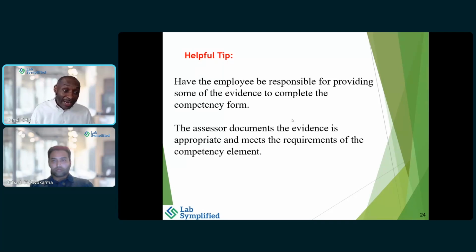You'd be surprised at things that you may see that someone does, and you ask them, well, why did you do that? Well, such and such told me that, or I learned this. Nope. If it's not following the SOP, you cannot accept that. You always have to be by the SOP. Always, again, be by the SOP. That is why you need to sit there and you need to watch them as they perform tests.